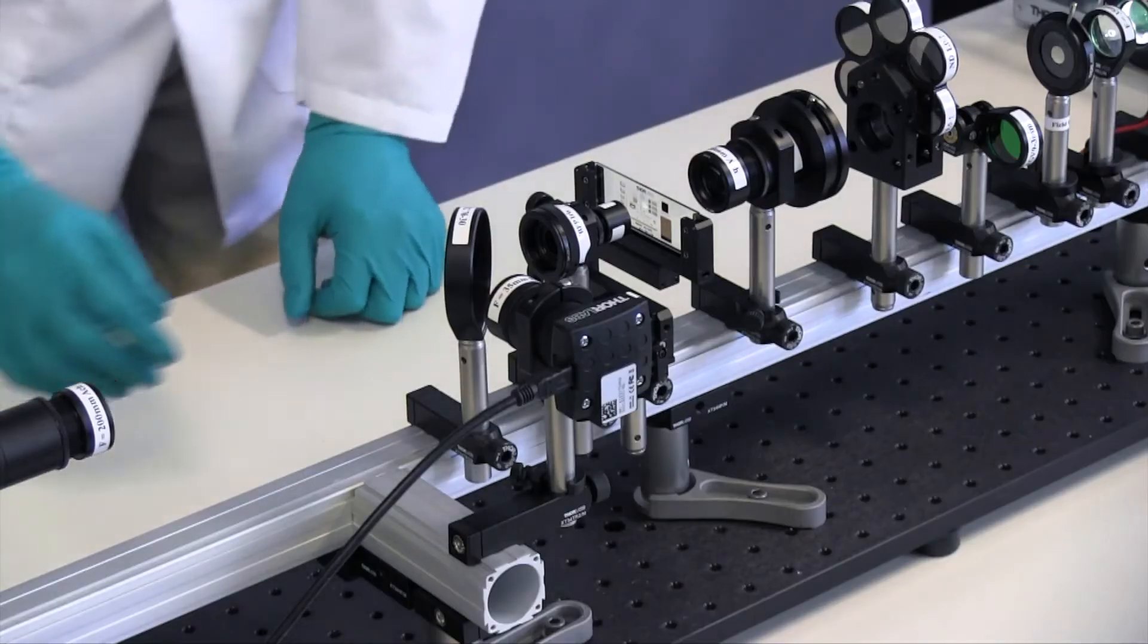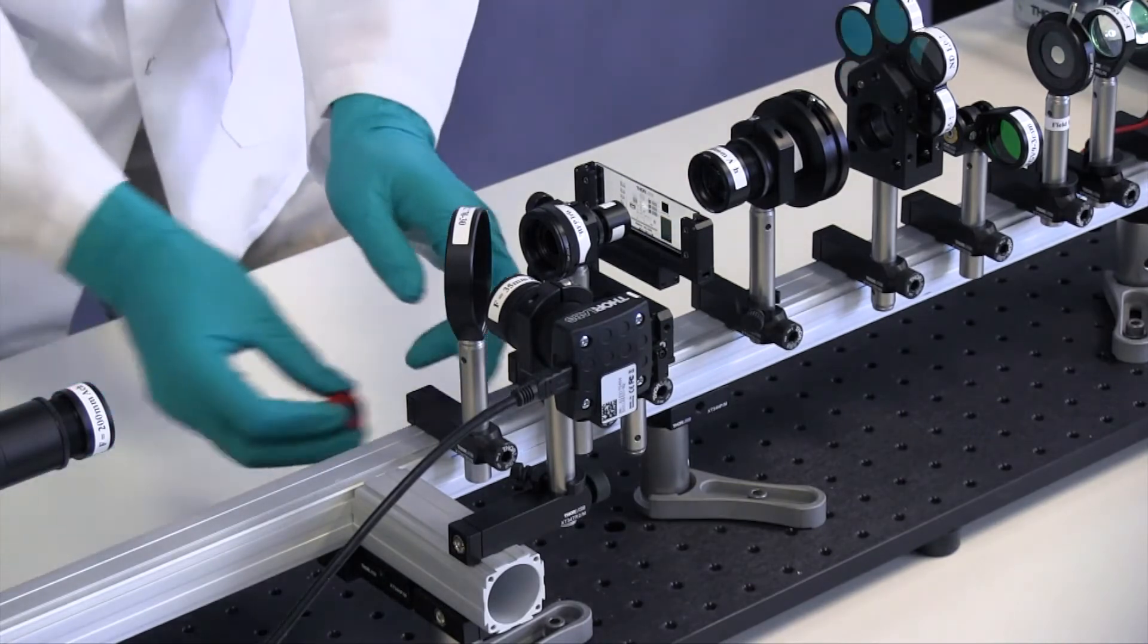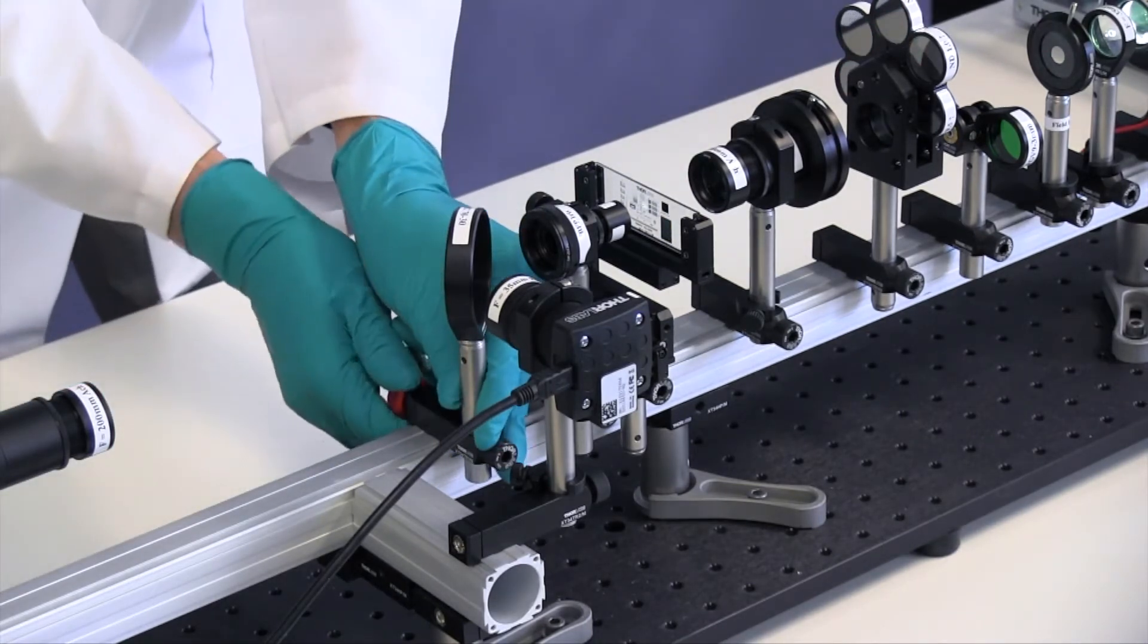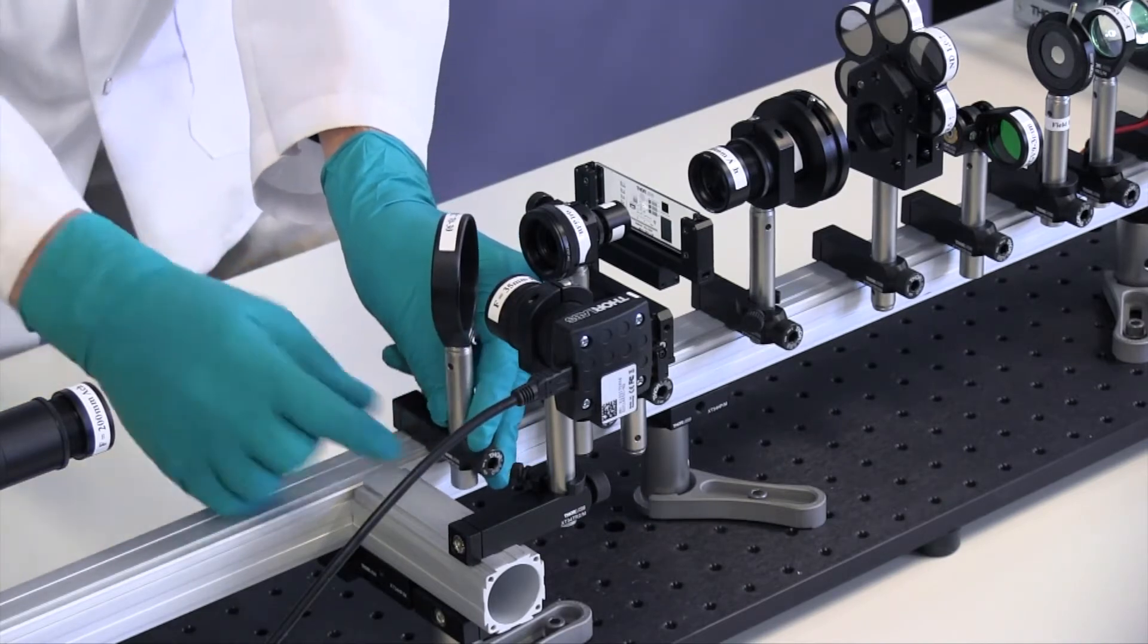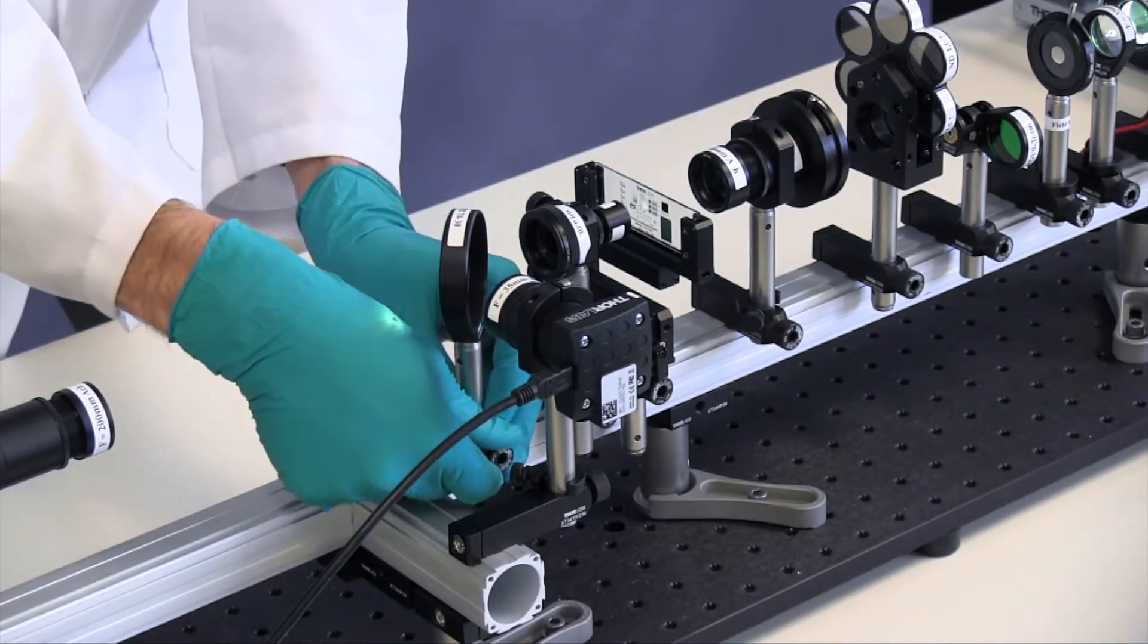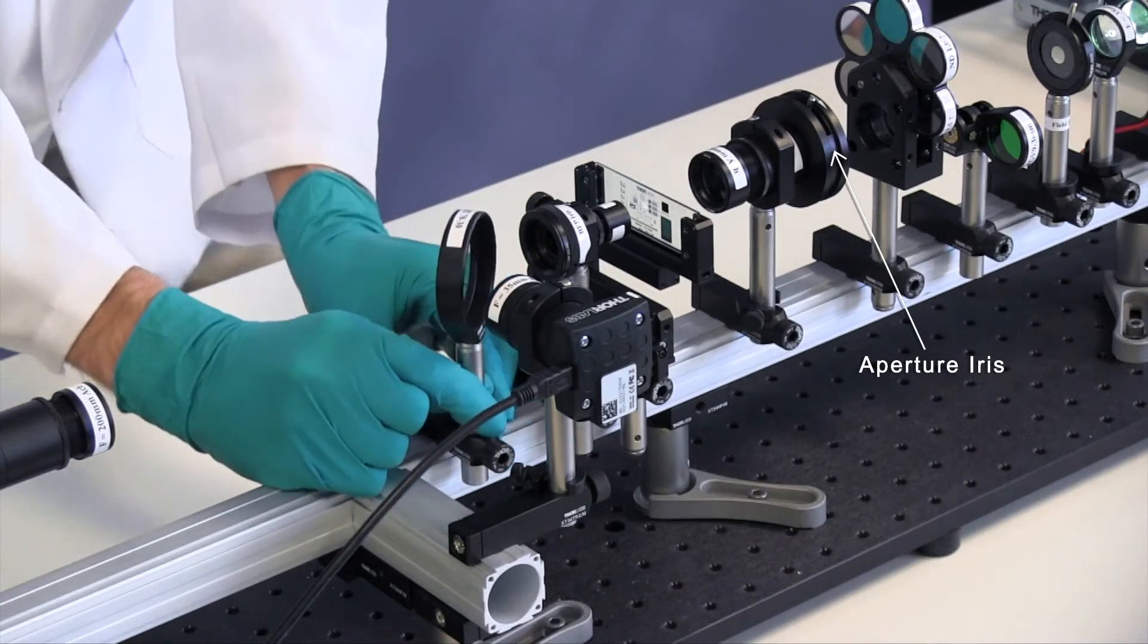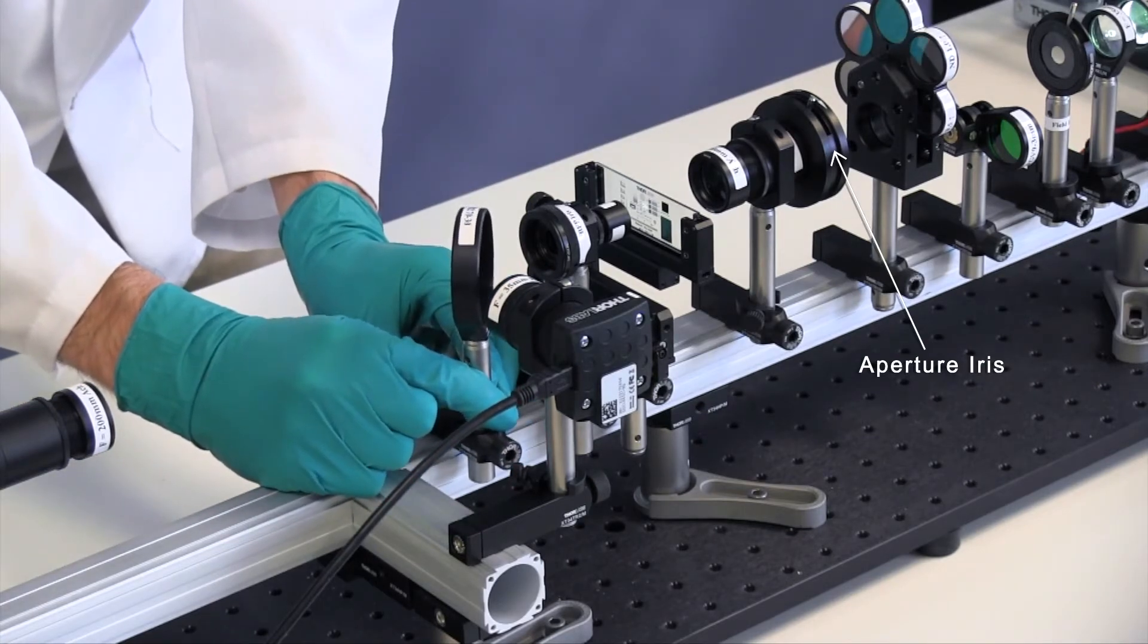Make sure the color camera is perpendicular to the rail. Adjust the position and angle of the beam splitter until you can see the light on the camera. Close down the aperture iris until it is slightly open and increase the exposure if needed.